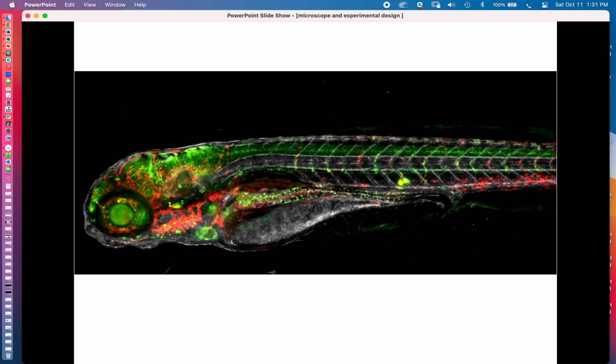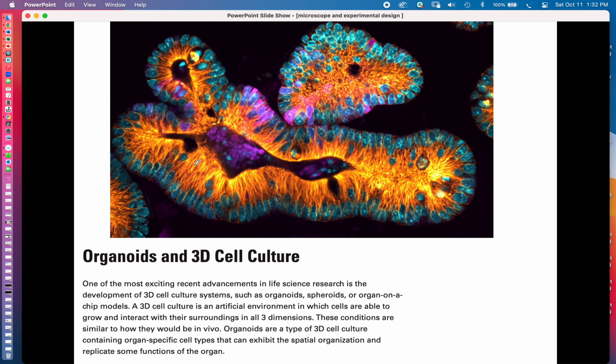And so here's an example of a really tiny fish embryo, and with this light sheet microscopy, it's going to be a fluorescent type microscopy. So we're getting that fluorescent glow because we stain the specimens with fluorochrome pigment, and you can just see this is going to be a bigger specimen, and we can see it in great detail. And scientists are interested in that, right? They don't want to just take a little slice; they want to see the whole organism, or the whole, like, embryonic brain.